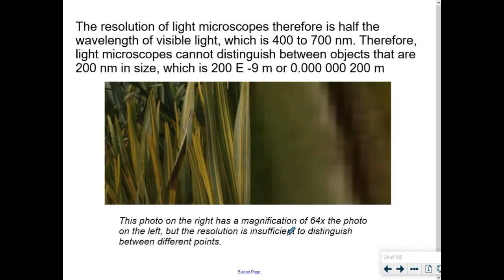That's what I've got on this slide right here. Here's a picture of two things. I found this on the internet somewhere. This, I believe, is leaves of something growing up, say, out of a pond. And zoomed further back, I can kind of see individual strands. Here's a leaf, and here's another leaf, and here's another little leaf. I can see individual pictures. The resolution on this picture is enough that I can individually make out this is different than that. Fair enough?